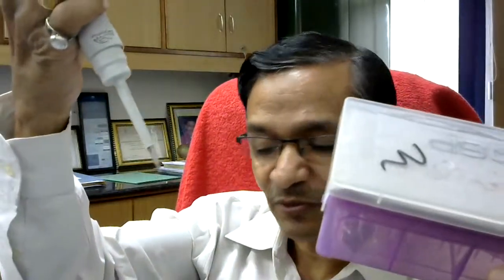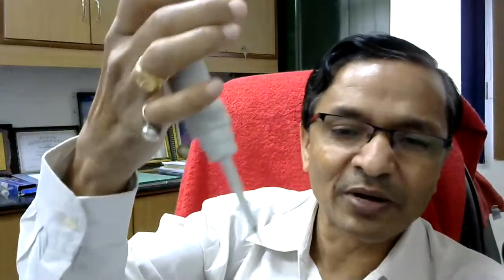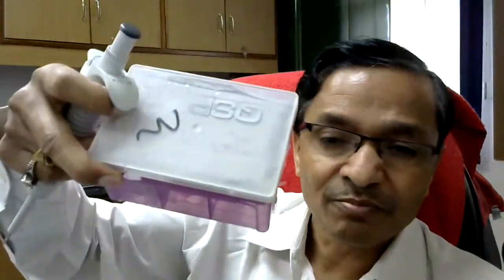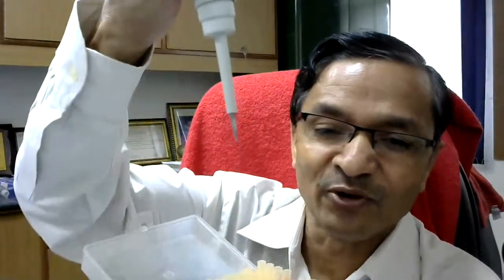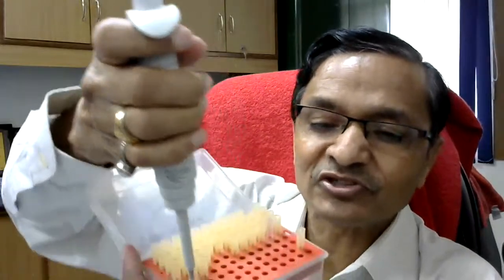this pipette requires micro pipette tips, these tips. By mistake, if I am doing this with a 2 microliter, or you can say 2.5 microliter pipette, it requires micro tips, but I am trying to use these yellow tips here. So what will happen? I put it here, no, the tip is not coming. The tip is still there because it is not fitting. So you have to ensure that tips and pipettes fit very well, otherwise you cannot use them.